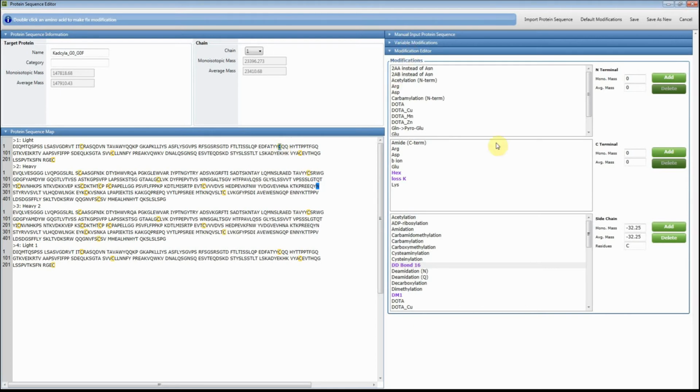Now for this complex molecule, because we can see the different glycoforms, and then we also have the different drug, we decided this is a little bit of an easier way to handle the data and interpret the data as well. And so the approach I took here was, in addition to creating this disulfide bond modification, I created the glycan modifications as well.